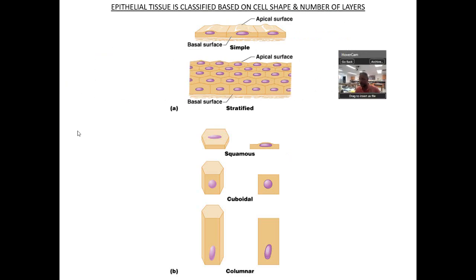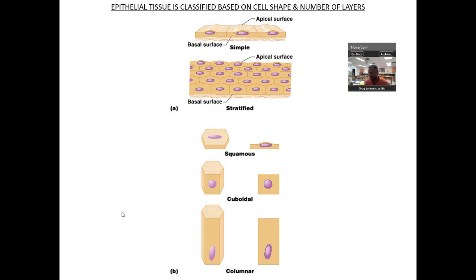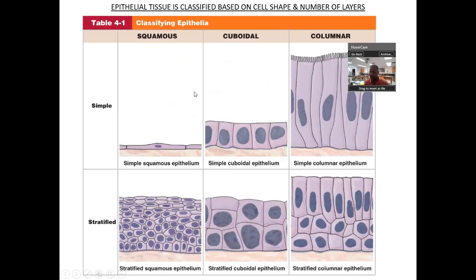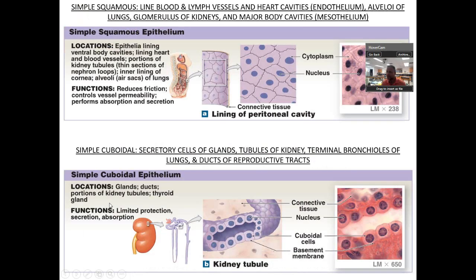Epithelial tissue is one of your four types of body tissues for histology. One of the things you want to focus on is the shape of the cells and the layers of the cells. I'm not going to go over this in great detail because I've made other videos you can watch. Remember, you've got shapes, and then you've got layers.